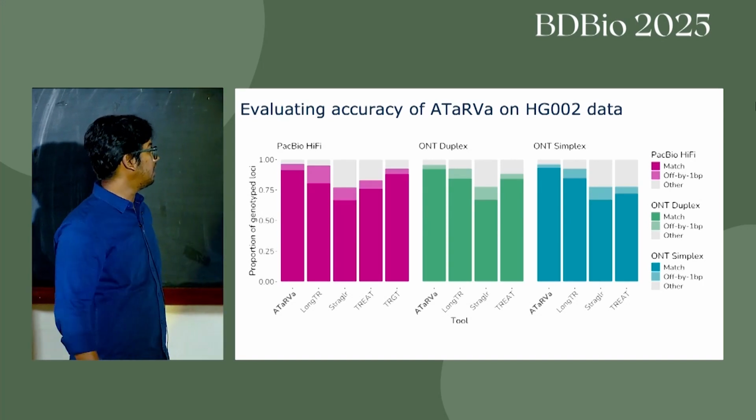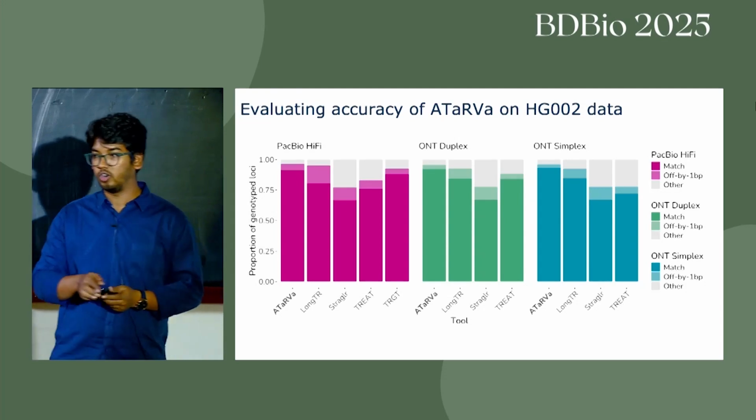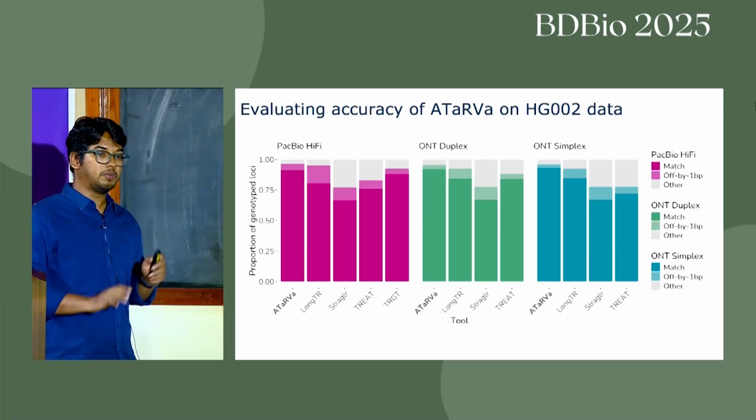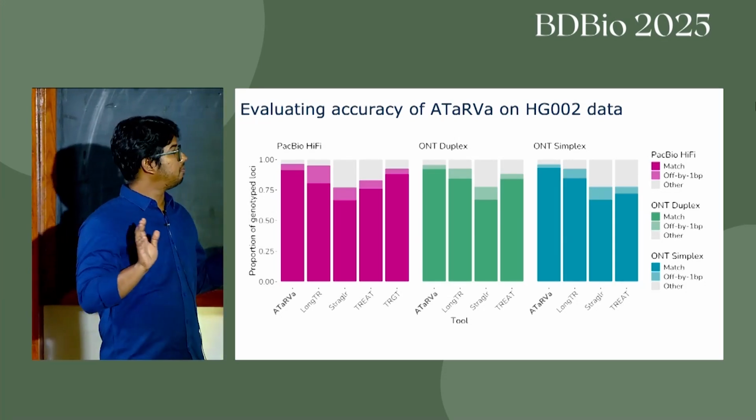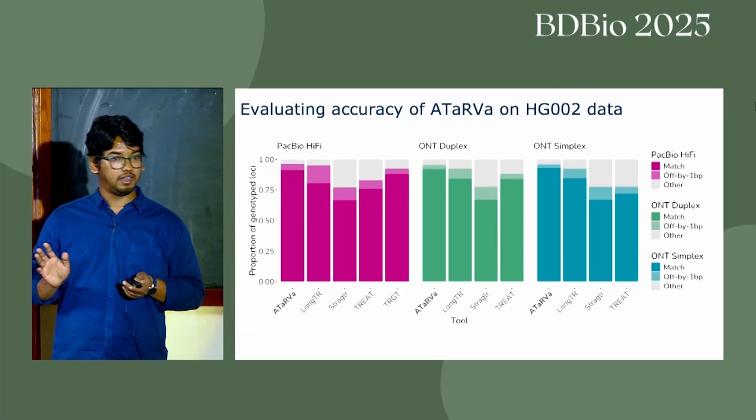Straglr and TREAT do not perform as well. So in all cases, it could perform better than the other tools.